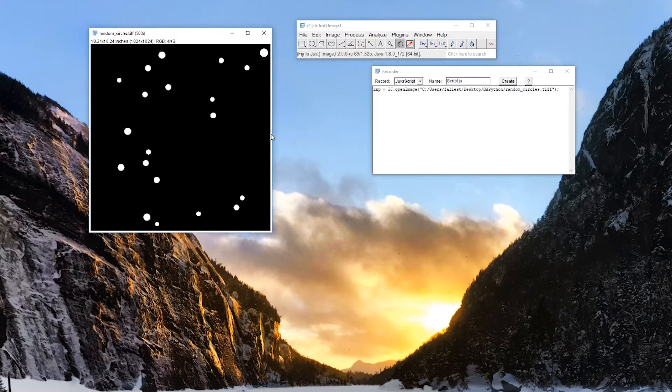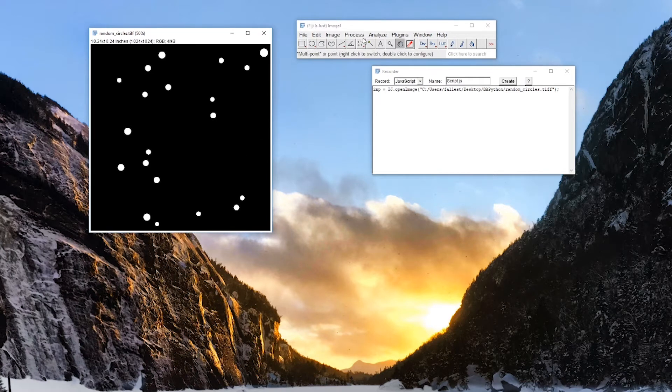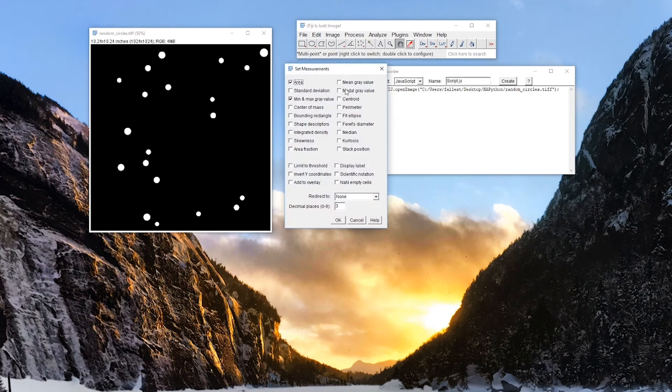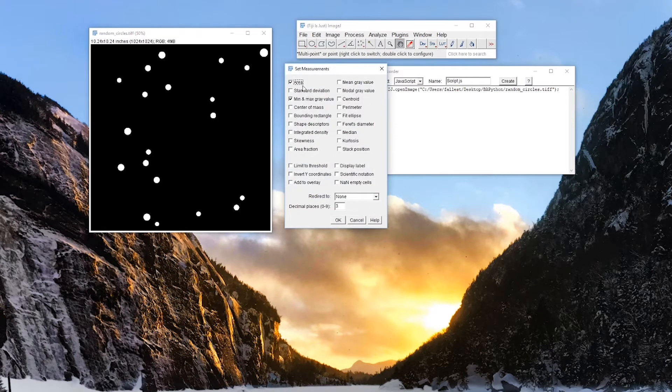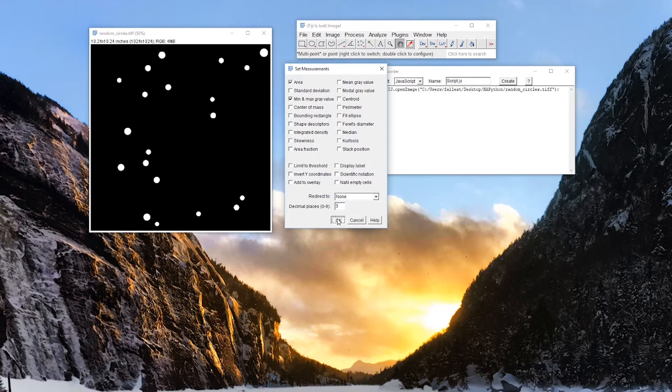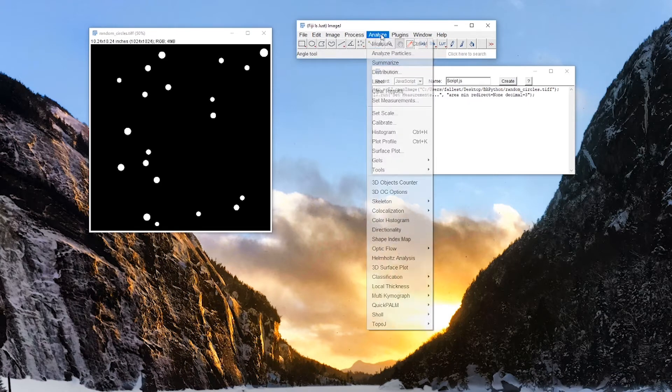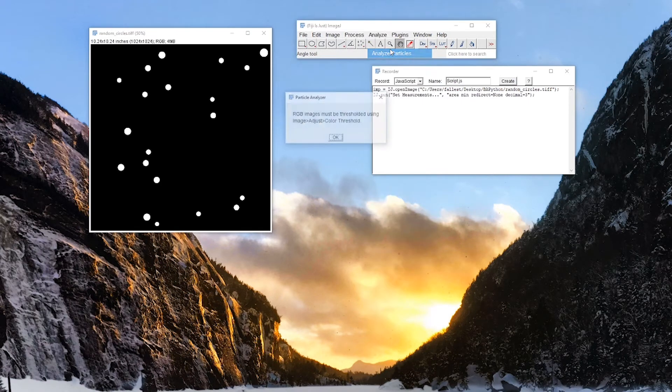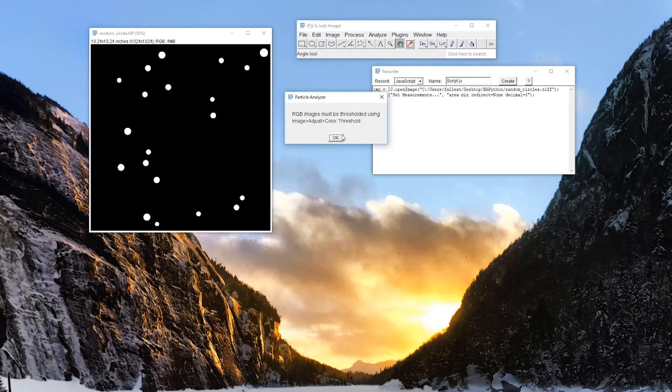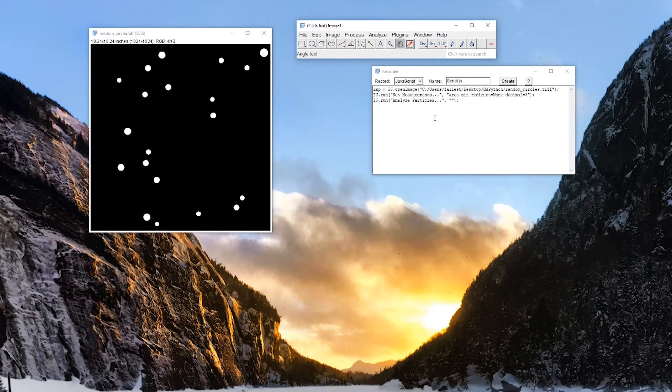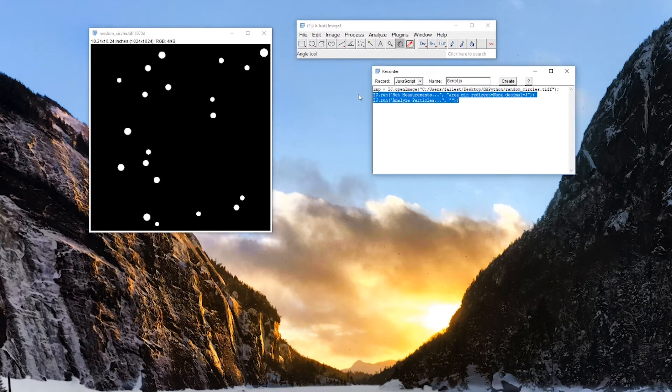So we can try to set measurements. We want the area and max gray value, sure. And if I try to run that, analyze particles, we have to first make this an 8-bit image or color threshold. So that didn't work. So I can just delete that out of the record.